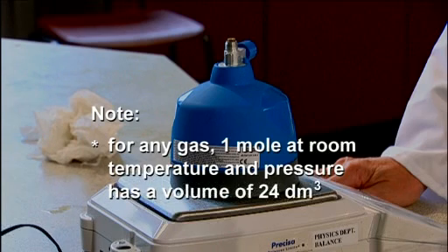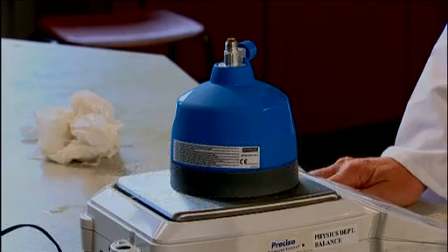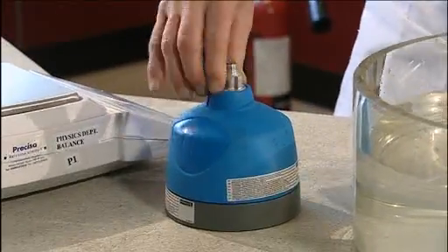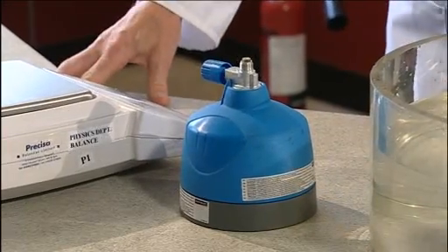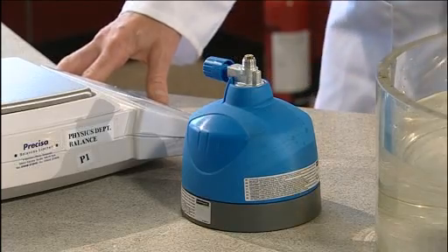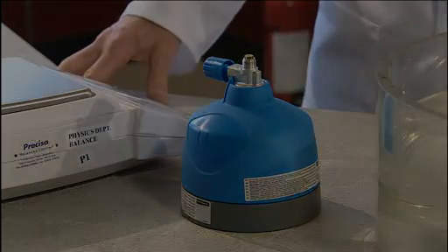If required, the pressure and temperature in the lab may be measured and a more accurate value calculated. But this risks missing the point of this simple experiment. Camping gas is in fact a mixture of propane and butane, and if we know the average relative molecular mass, then we can actually calculate the percentage composition of the gas mixture.